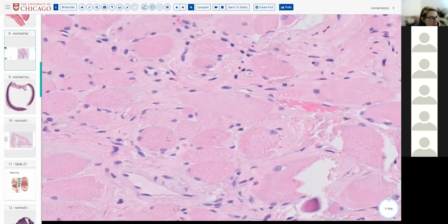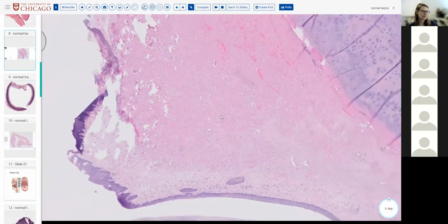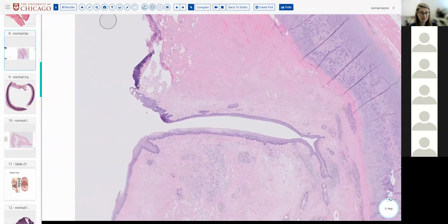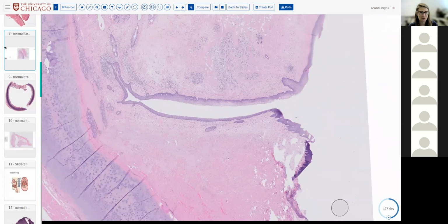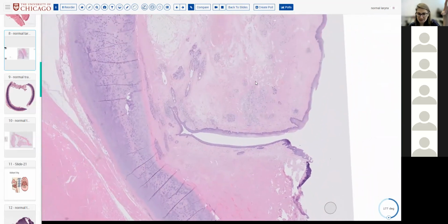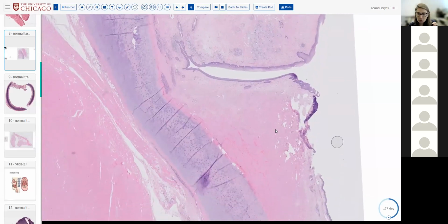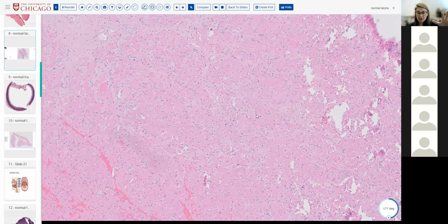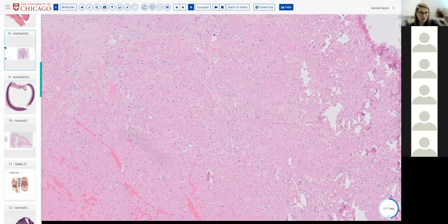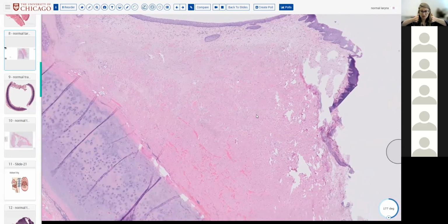Oh, muscle. All right. So Christina is correct for the following. I'm going to rotate it. So the false is now on top where it should be anatomically, and the true is on the bottom. The true has the skeletal muscle of the thyroarytenoid and the vocalis muscles running through it, right? These are the muscles that lengthen and shorten your vocal cords to change the pitch of your voice, okay?